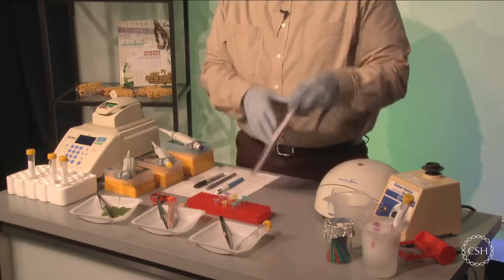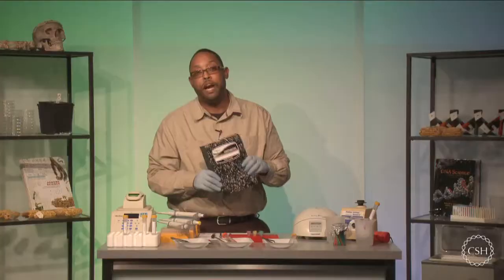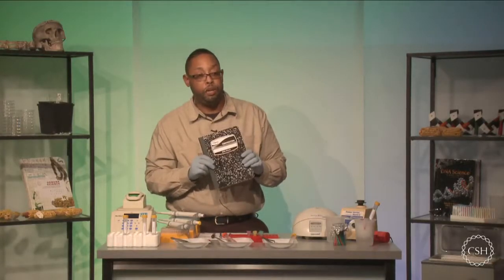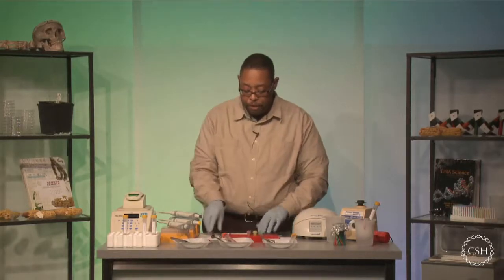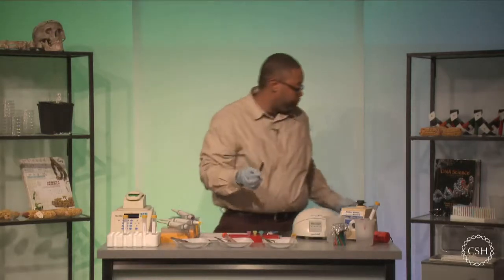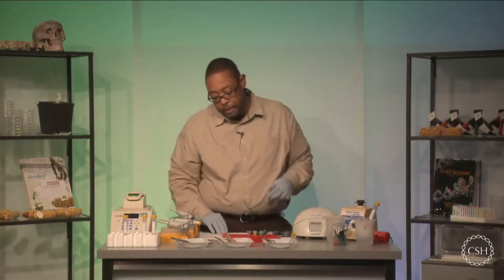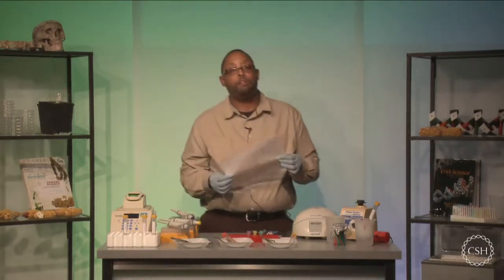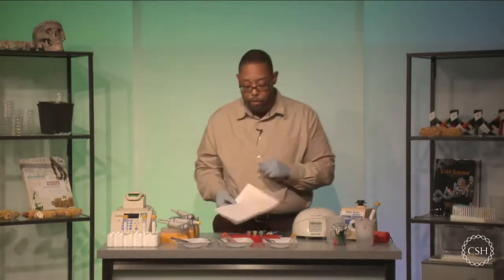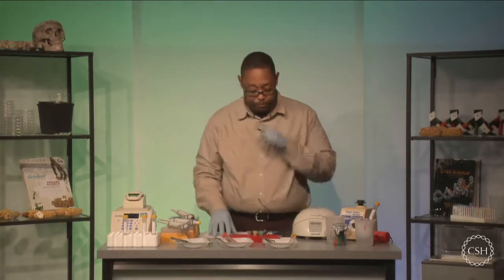One of the things I will promote is that you gotta have a notebook around. You've gotta be able to jot down notes about your material, so please have your notebook nearby so that you can keep notes of everything that's happening. You're obviously gonna need something to write with, so you should have a pen around and a marker. This will allow you to label your samples. And then you should have your protocol available to you with any notes that you need on that as well. So please make sure you have all these things physically around with you.